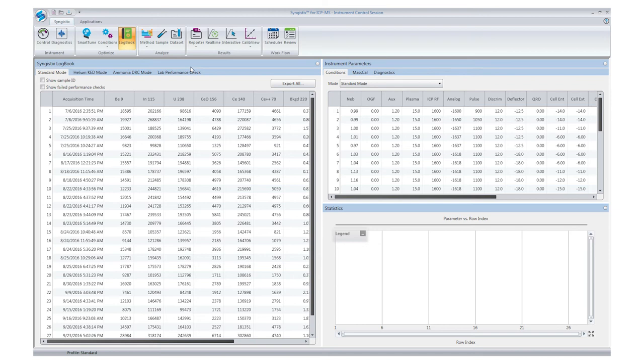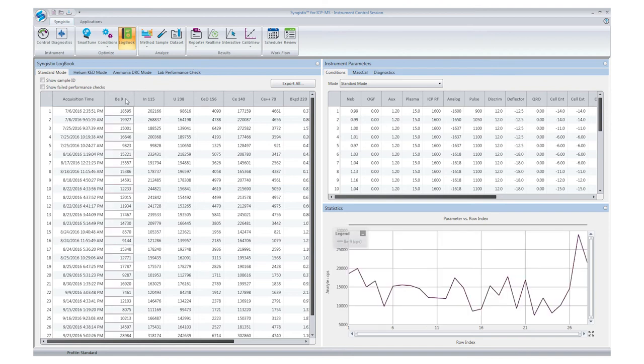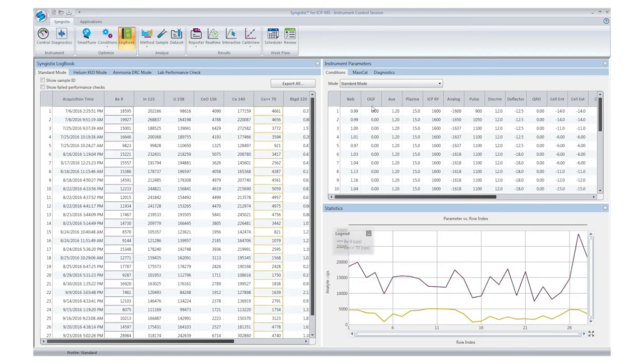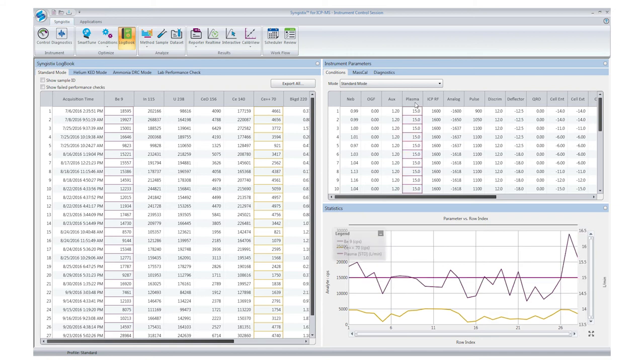To chart any parameter, just click on the column header. Up to two different units can be plotted on the y-axis at a time. In this example, counts per second is on the primary axis, and power is on the secondary y-axis.